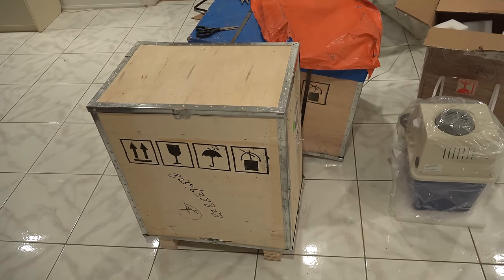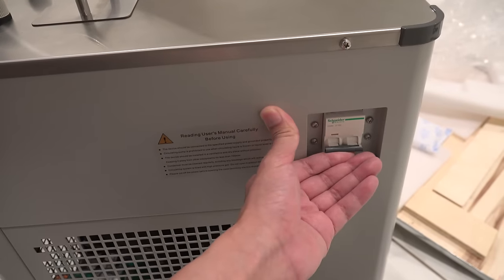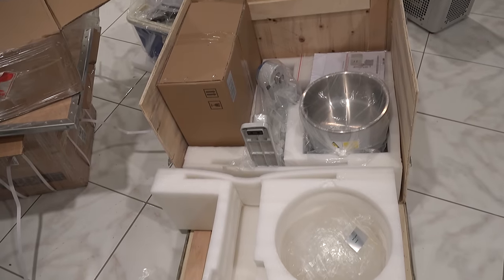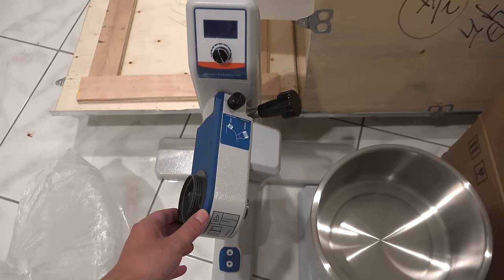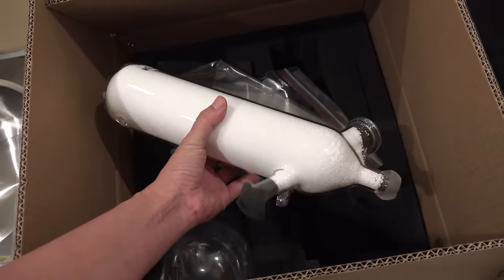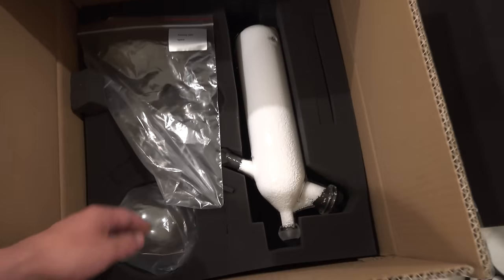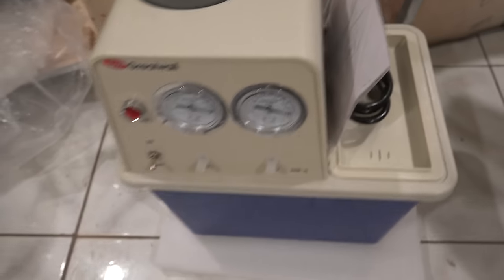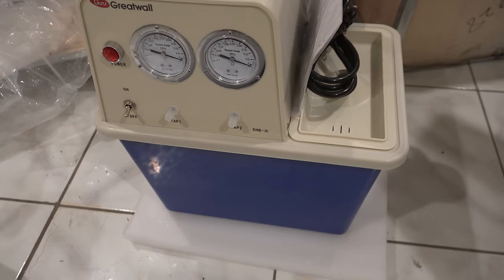I'm already unboxing it and I must say I'm quite impressed at how well and properly packaged this is — all brand new. I was half expecting to receive defective charity, broken surplus, used detritus, or stuff that fell off the back of a truck. After getting multiple things broken during shipping due to bad packaging, my hopes were not high. But this is all pretty good — properly cushioned and protected. Even the extremely fragile condenser coil is filled with packing foam to absorb shocks, and my inspection shows everything is good and undamaged.